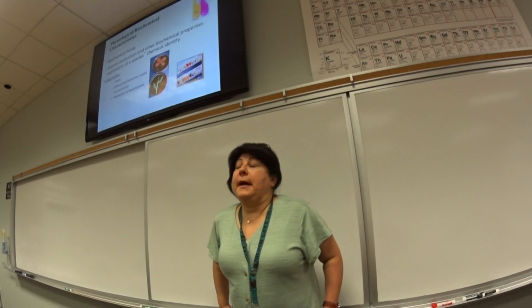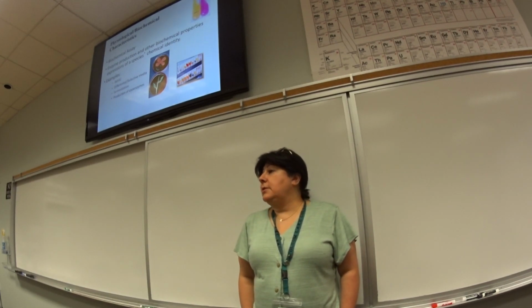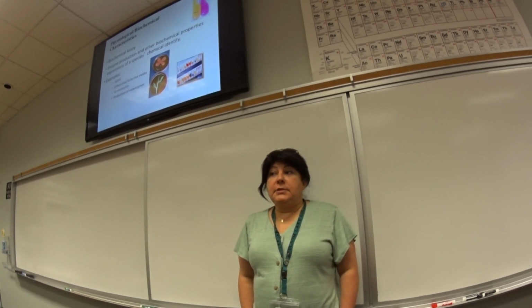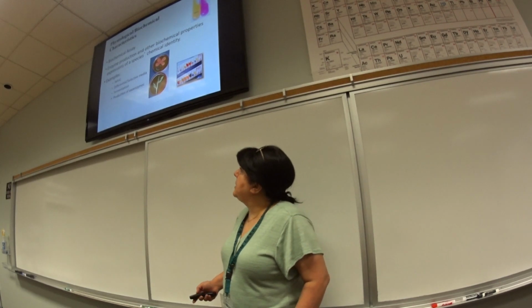Then the other phenotypic characteristics, remember, it's the enzymes. What genes do they have for what enzymes? So those were the biochemical assays that we did. So for our unknowns, you're going to do biochemical assays. And all of these biochemical assays that we've done so far, you have access to all of them. And that should allow you to distinguish.